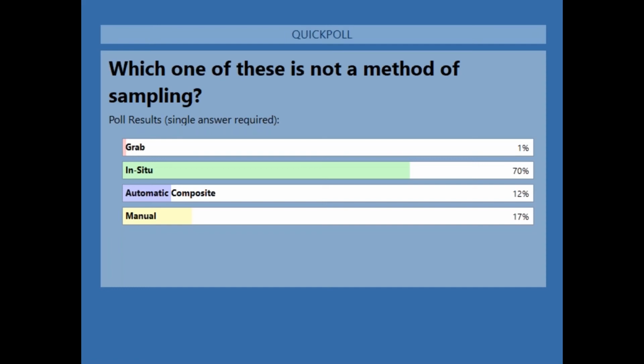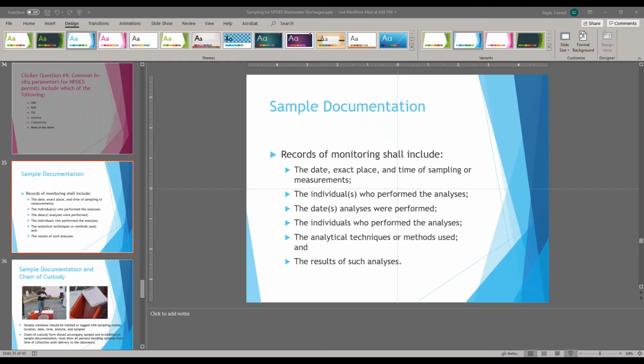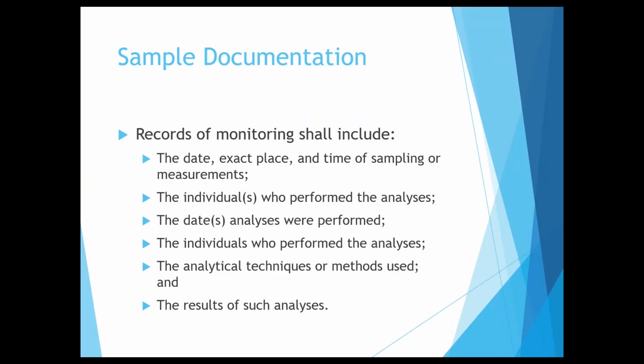And somebody had the question about their pH meter. Again, not covered in today's topic, but your pH meter doesn't have to be certified by the state. The thermometer that you use must be NIST traceable. Your pH meter, now your state may say it needs to be certified, but there's nothing in Standard Methods or in the 40 CFR that says it has to be certified. So again, your state may say it needs to be certified, but 40 CFR does not say that. However, you still need to keep your records of calibration. You still need to keep all of those things.